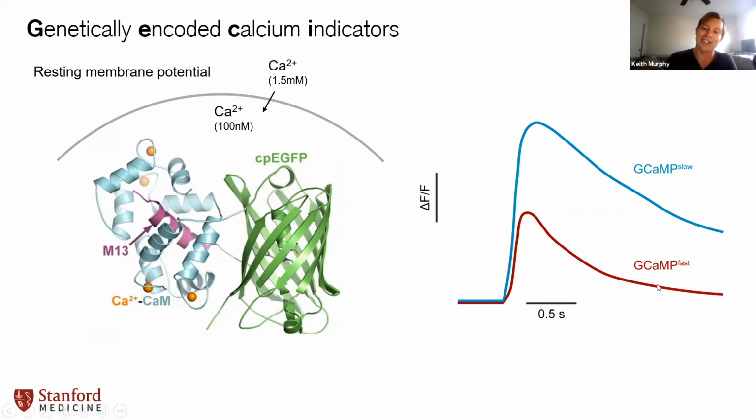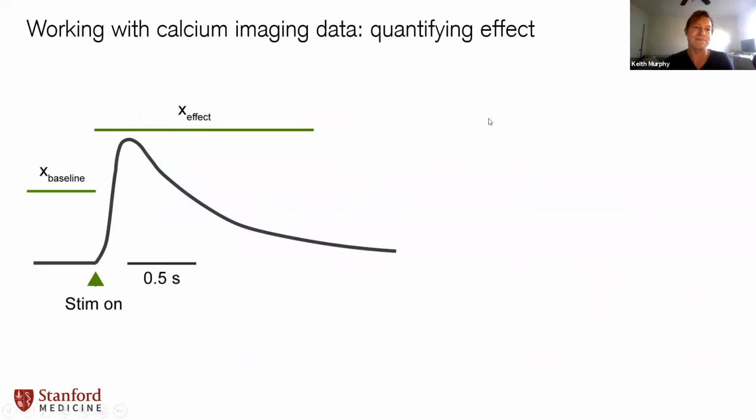And I got to tell you, everybody, these genetically encoded indicators are very finicky. Whether or not your virus transduces the cells very well, it can be difficult to get good labeling sometimes. So that can be quite important. Just to give you a working knowledge of a way to actually quantify your effect, and everybody has their own flavor of doing this. Courses are taught on different methods. You just have to read between the lines and ask how each group does it.